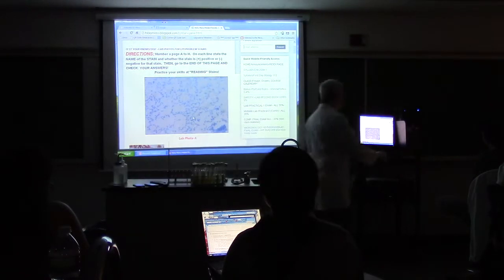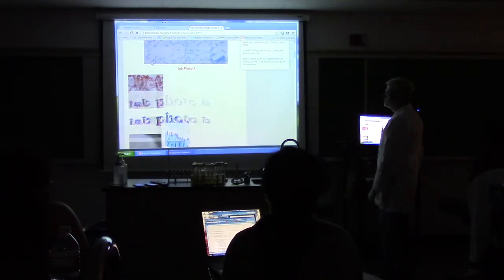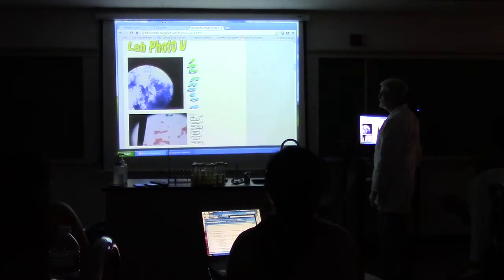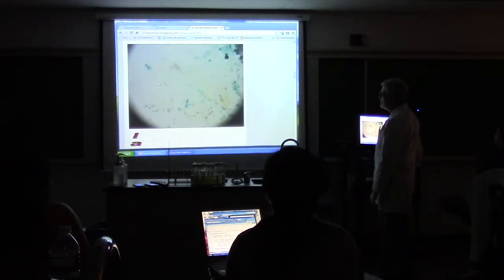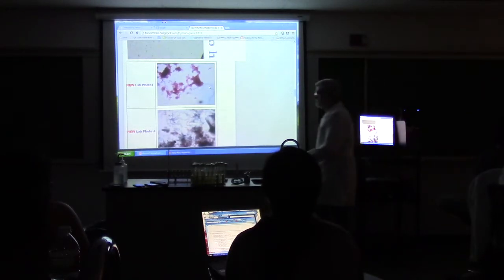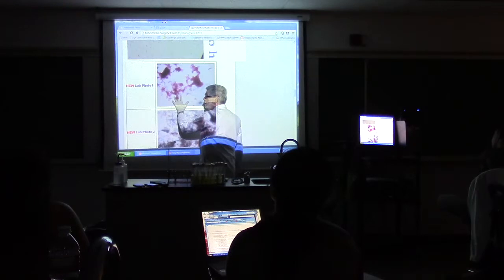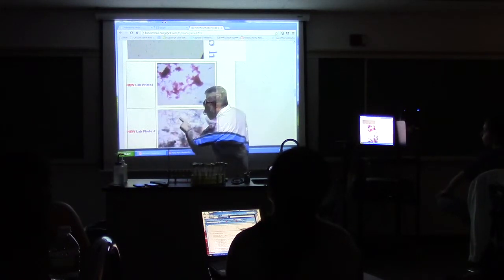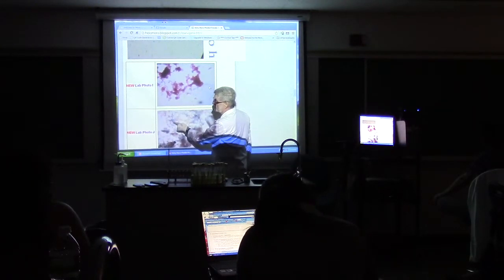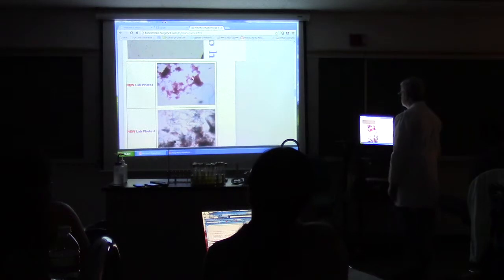All right, if you looked at the next one, that one would be pink, and there are little pieces of garbage green here, so this you know was endospore. Now this one is very hard to read here. I won't give you that harder one on the test. Let's go down to, there. This is one that's been cooked a little bit too much. There's a few baby blue here. It's mostly hot pink. Now, there is a difference between this pink and that pink. This is hot pink. That's saffron pink. And that's green. So it is going to be a little bit hard for you to see, but if you do the pairings, you shouldn't have trouble.